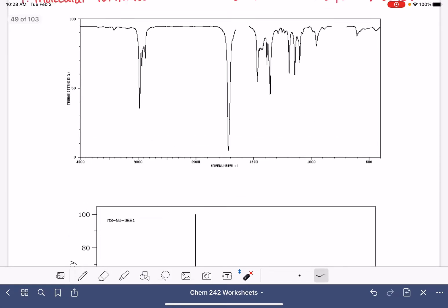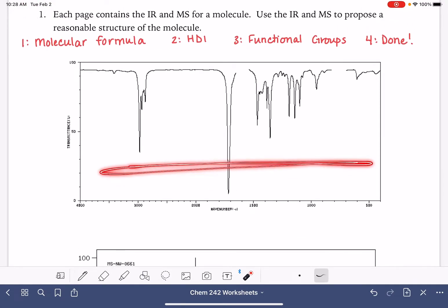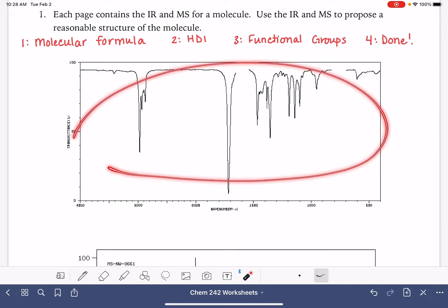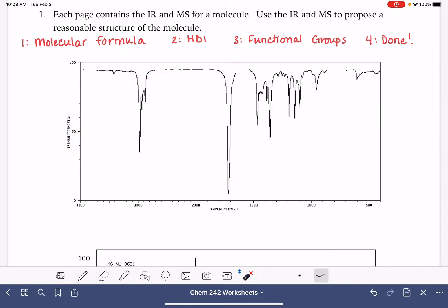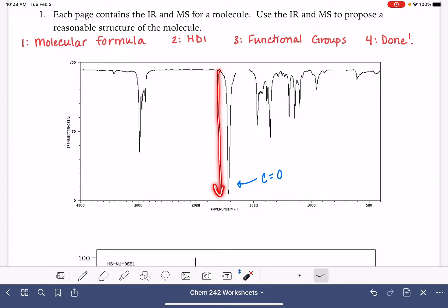So our first job is to really quickly scan the IR — we're not doing a full-blown IR analysis at this point, we're just quickly scanning to determine if we have any oxygen in the molecule. I can see a peak right here located around 1700, a very strong peak. It's a little bit spikier than normal, but it's very strong, which tells me that we do have a carbon-oxygen double bond. So we know that we have oxygen present.